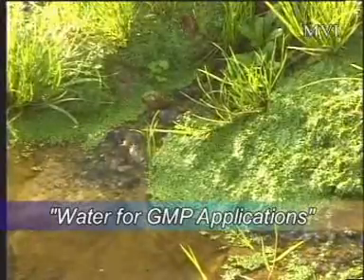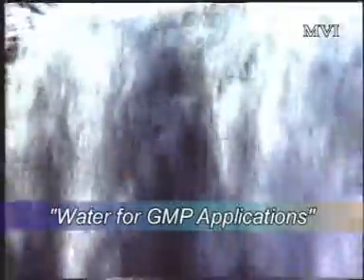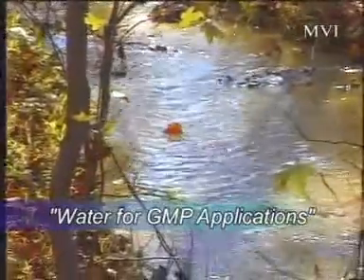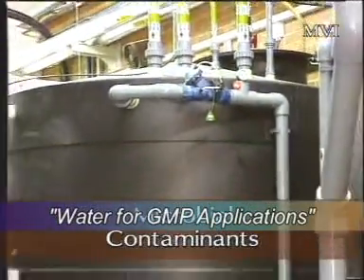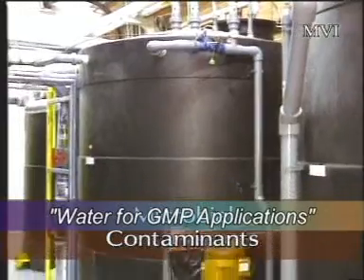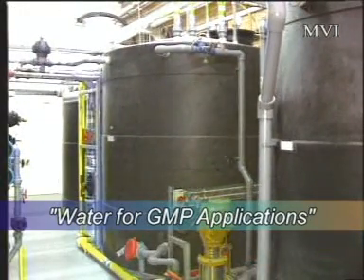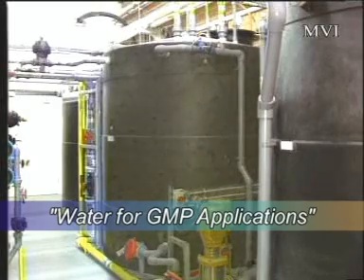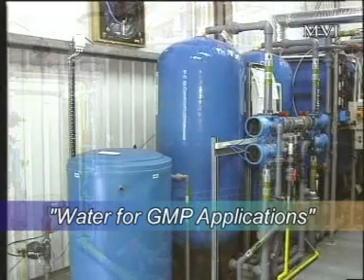The quality of feed water varies from one country to another, in different parts of the same country, and also from one local site to another. Even with this variation, incoming water delivered by the local water company may contain microbial contaminants, including bacteria and pyrogens, albeit at low levels. However, as these can develop rapidly, they must be controlled by a water purification system.